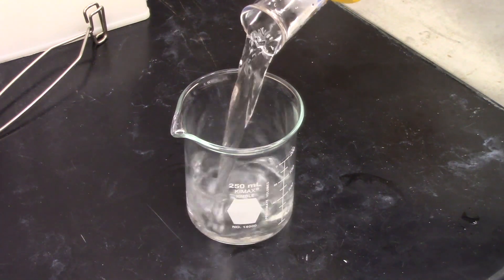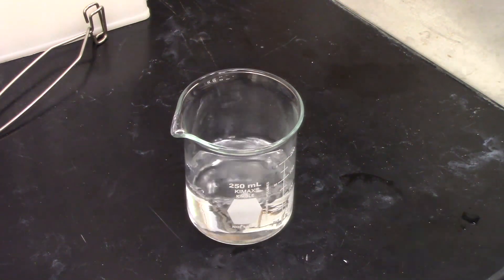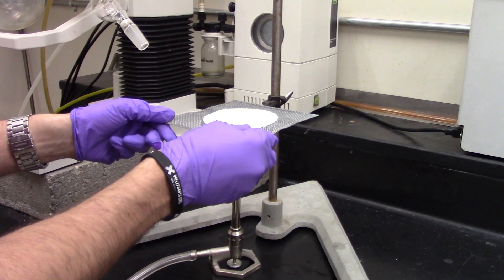Prepare a water bath by filling a 250 mL beaker three quarters full of water. Place the beaker on the ring stand and heat to 90 degrees Celsius.